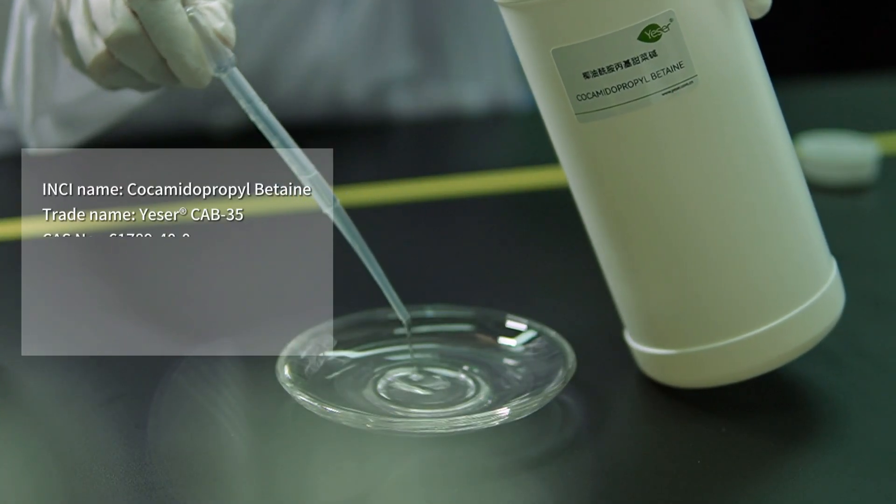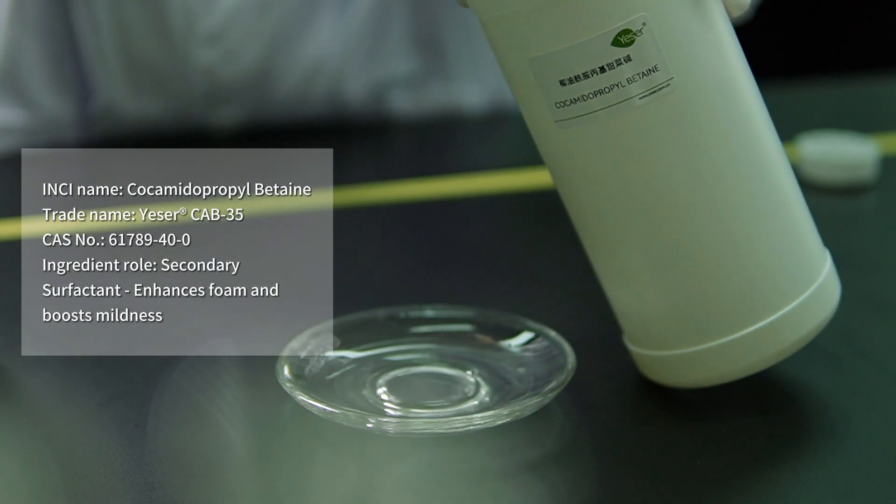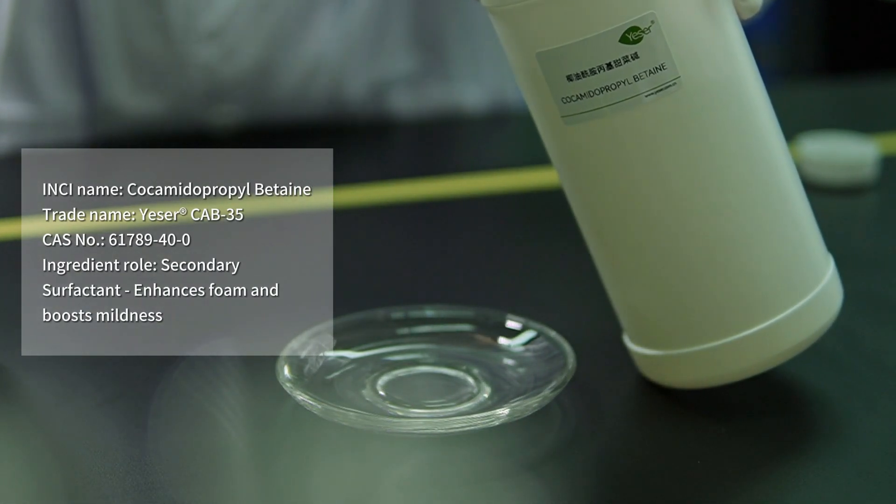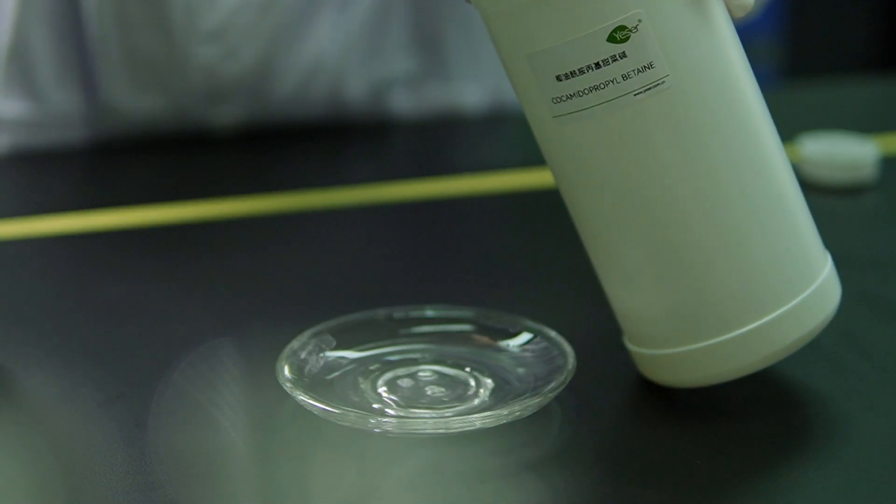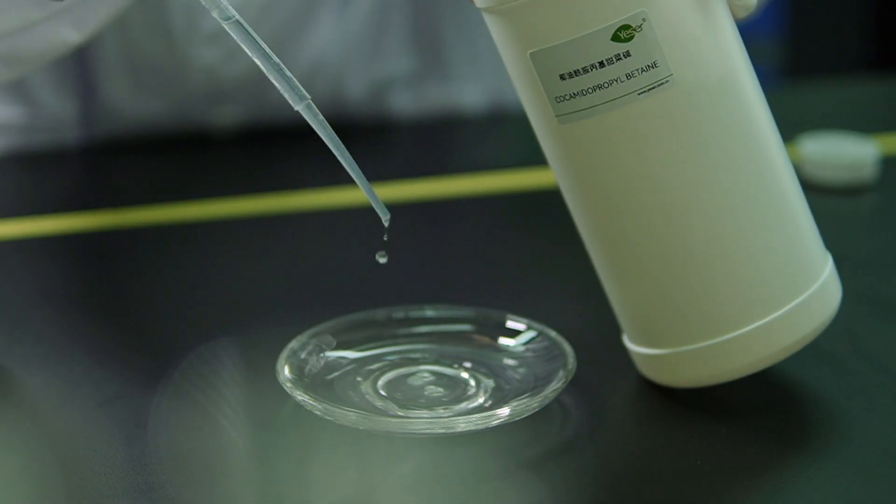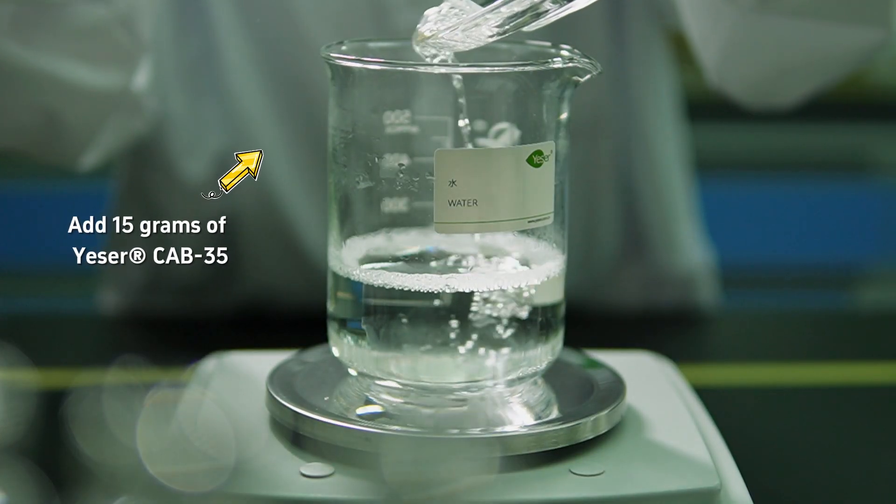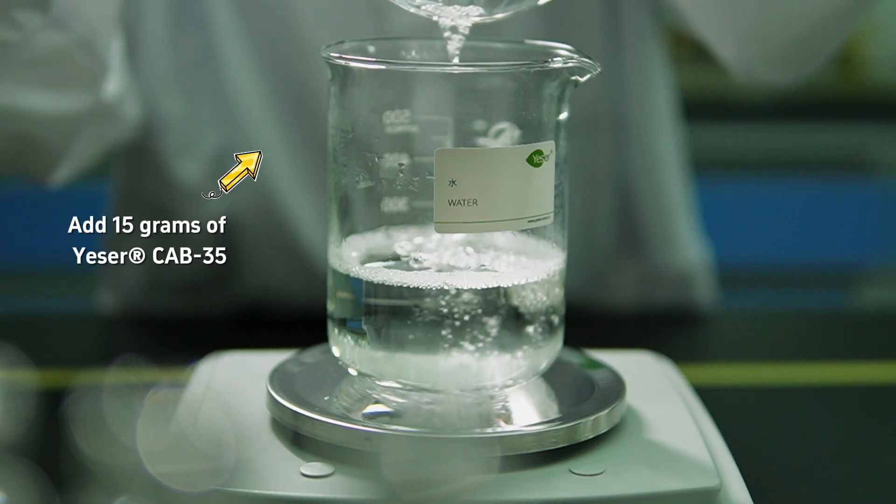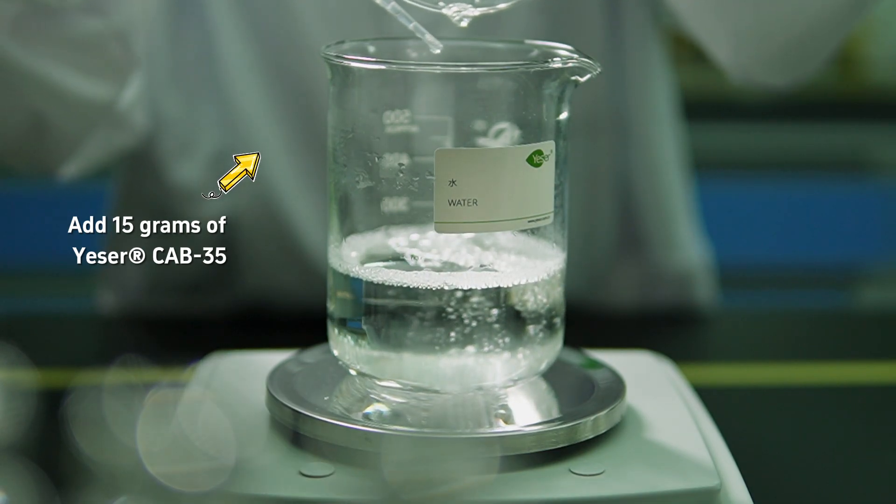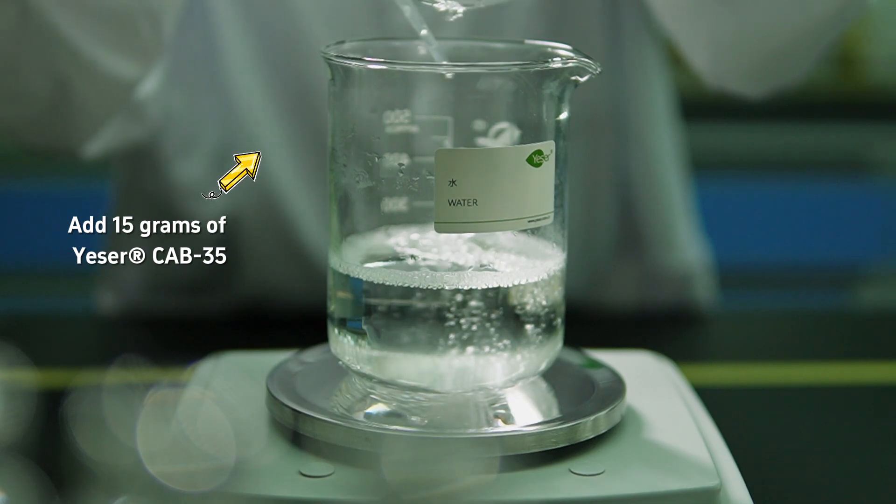Moving on to Phase B. We've got two more ingredients on deck, Yeser CAB-35 and Yeser CDEA, proudly produced by Yeser Chemicals. These two are well-known secondary surfactants in the world of detergents and personal care products. First up is CAB-35, also commonly known as CAPB 35%. This stuff is awesome for boosting foam and it's really mild, which is great for keeping our bath gel gentle on your skin.